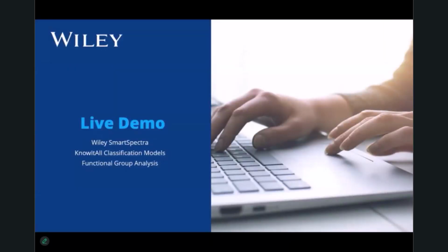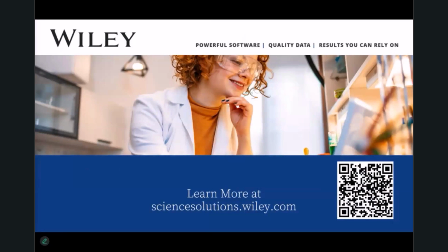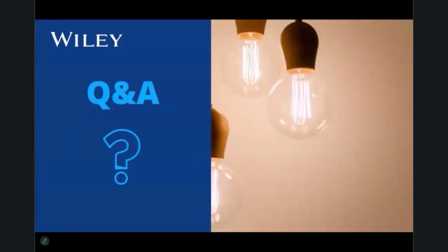Those were the three examples for the three alternate methods to identifying a spectrum. That's the end of the demo. And thank you for listening to my presentation. We can now jump into the Q&A.